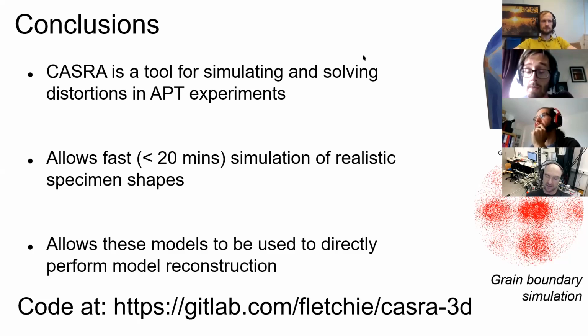Yeah. I'm using Seagull to do the adaptive meshing. It runs as an isotropic remeshing algorithm in Seagull, and that ensures that the mesh is well conditioned for the electrostatic solver. So it's based on an octree then, probably. Yeah. Is that what it does? Yes, I think I'm not exactly sure, but I think it's based on some tree-based method. And then with the isotropic remeshing, you can remesh at different sizes down the shank.